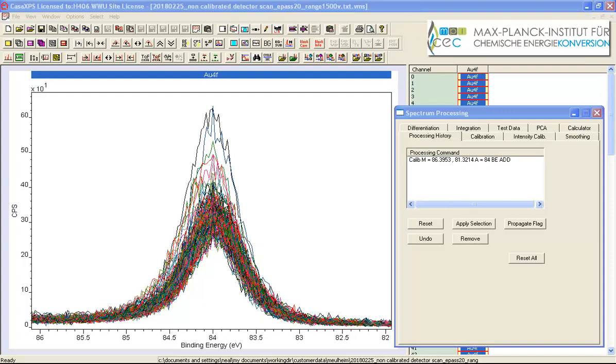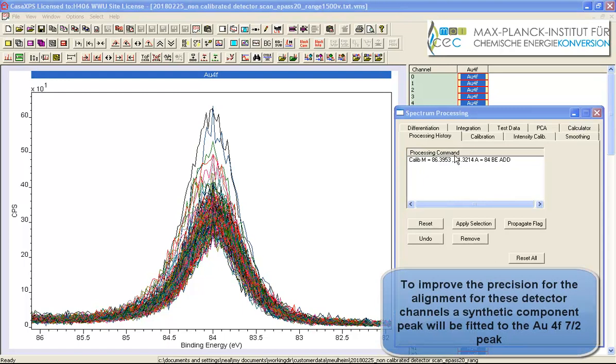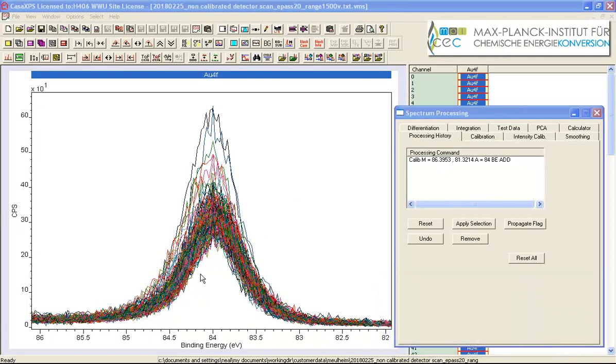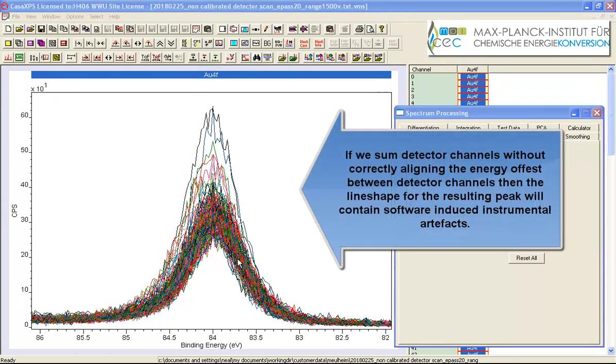So while these are all aligned in terms of this energy interval here what we really need is to do this as precisely as possible especially if we want to have the minimum full width half maximum for this peak we want to make sure all of these peaks are well aligned and we'll do this by using the quantification parameters dialog window to create a region.